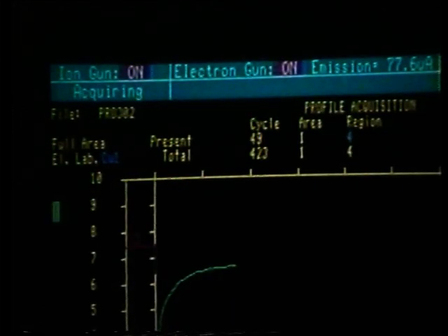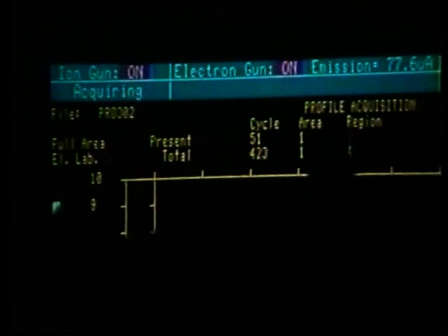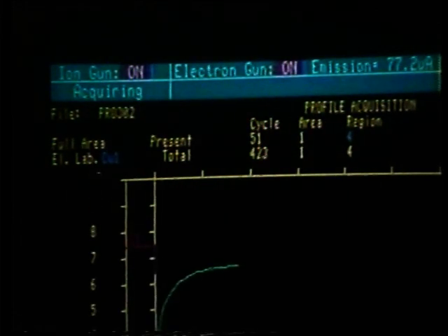To further demonstrate the speed, let's take a closer look at the element label and the region number corresponding with that element. Notice how quickly we go through the elements, spending most of the time on carbon. The element label displayed is the last label drawn, so it draws the copper, and while it acquires the carbon peak, it sits longest displaying the copper peak. Notice that we very quickly go through carbon, oxygen, chromium, and copper, much quicker than in the window profile mode.